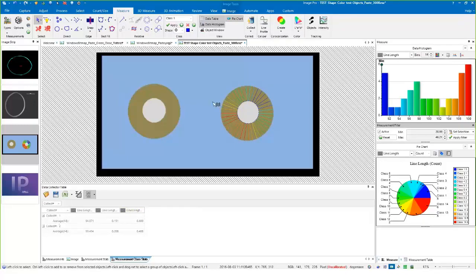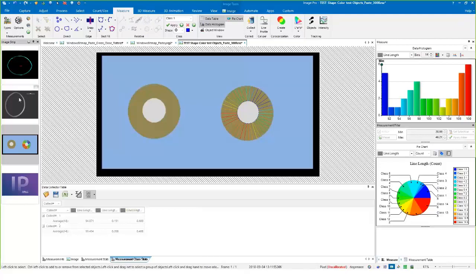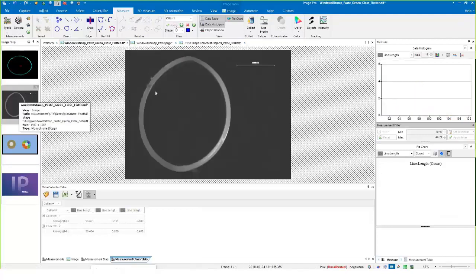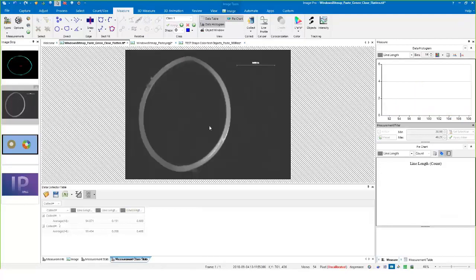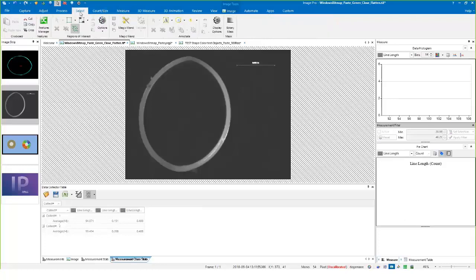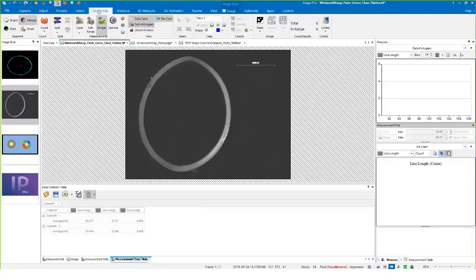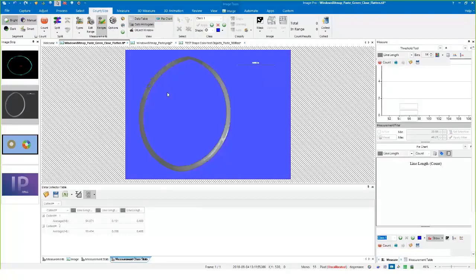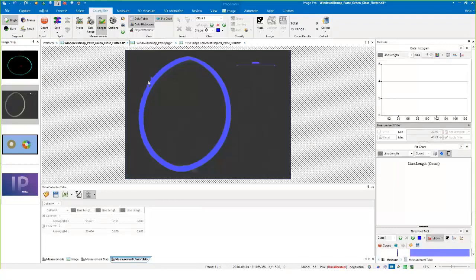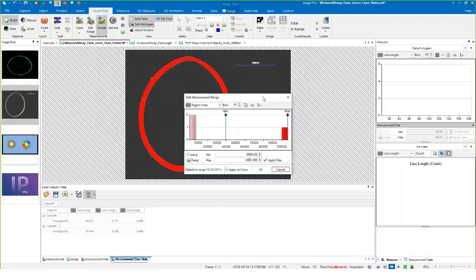A quick version of the actual sample itself. Basically you can use the same kind of routine. In this case it's a bright segmentation, we have an object here like this. I'm just going to get rid of these guys or let me apply a filter range.